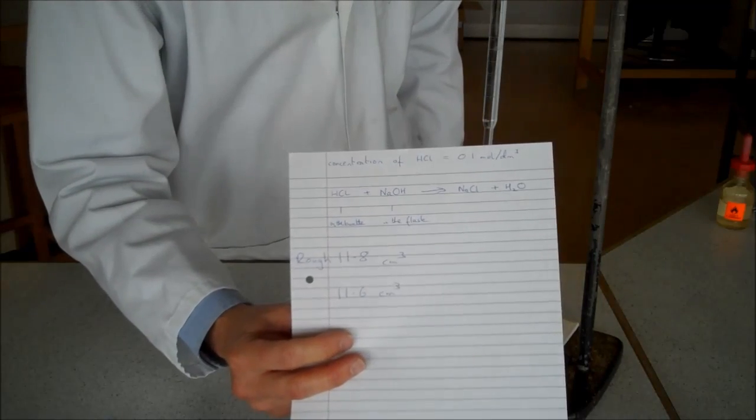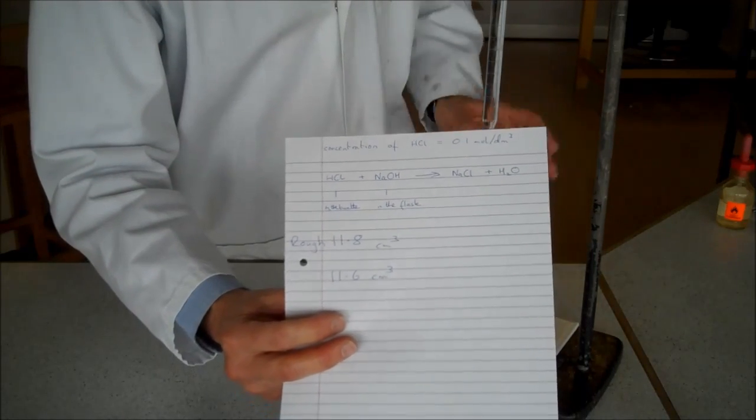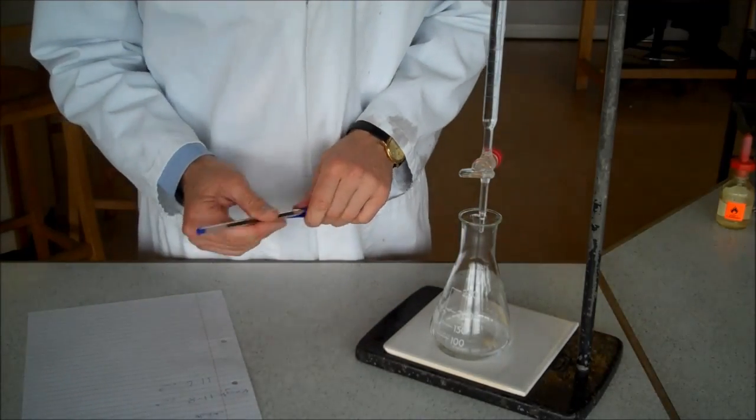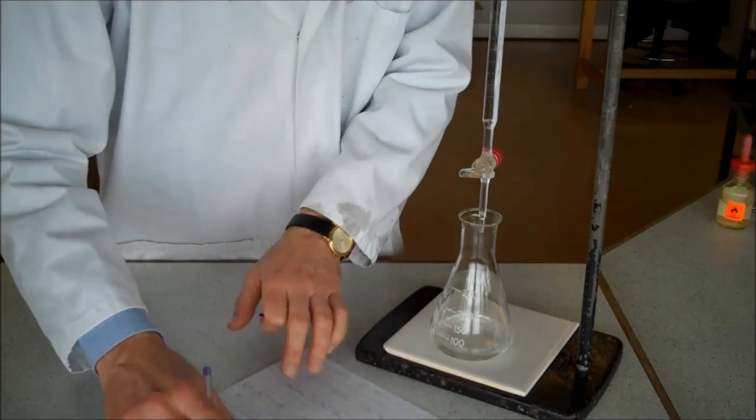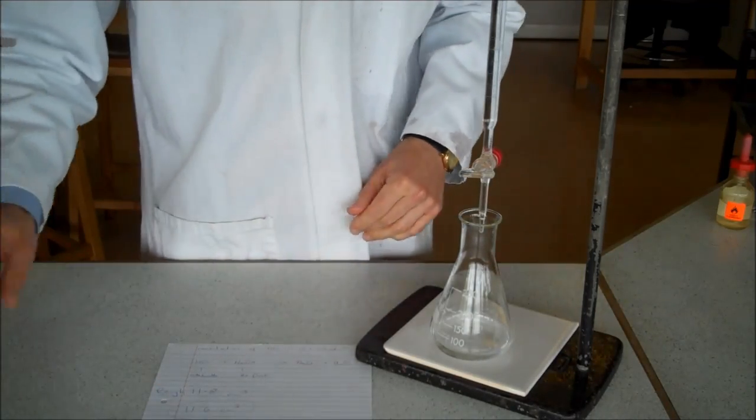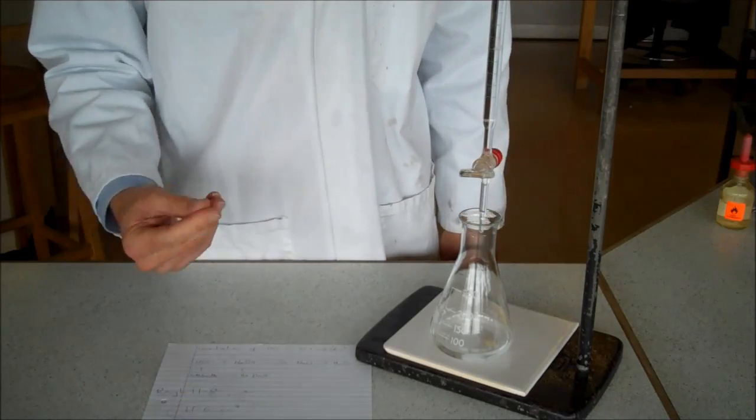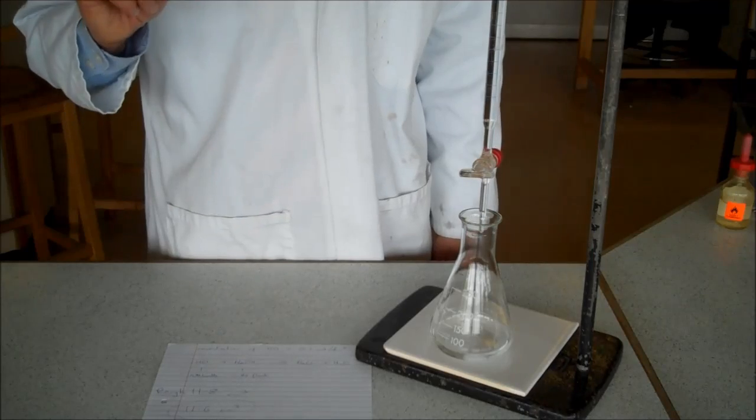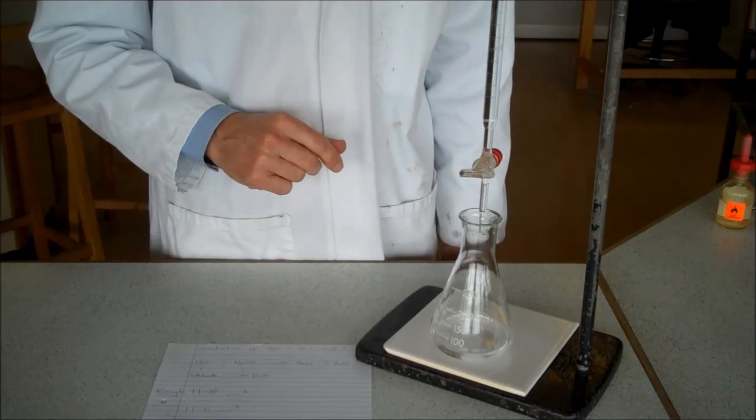What I would do now is repeat it again, exactly the same method as before, and hopefully my next repeat would be close to 11.6. And if it was close enough, I'd take an average, and that would give me a very accurate result for the volume of acid I needed to neutralise my alkali.